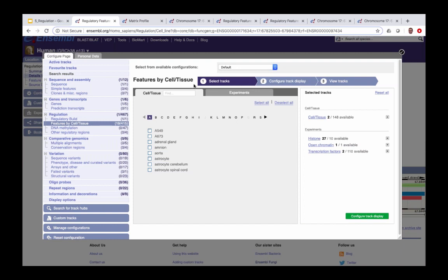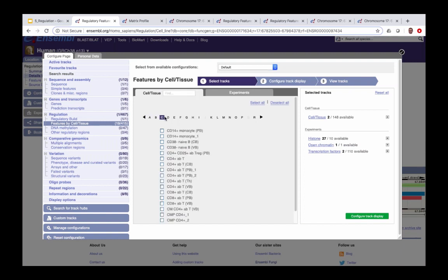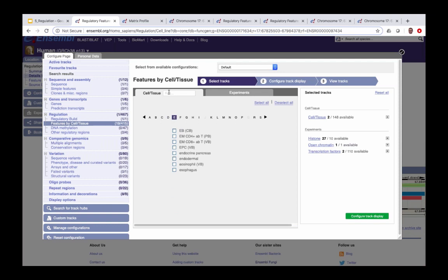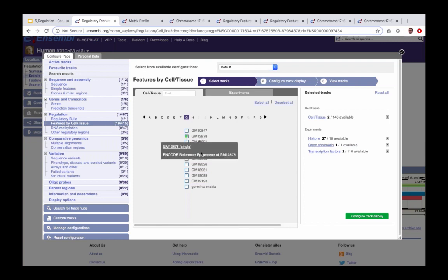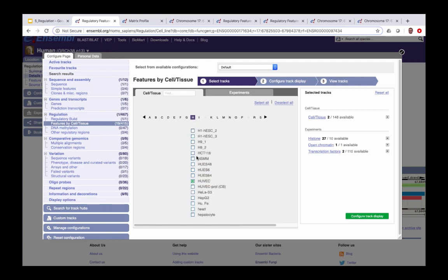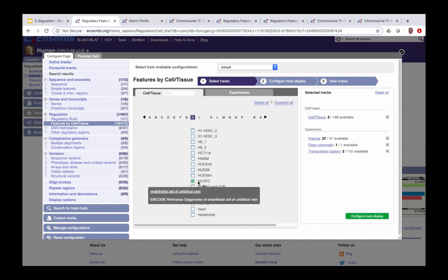In the configuration pop-up, we have two tabs. First, the cell/tissue tab where we can use the search function or browse alphabetically to find cell types. I'm going to add the GM12878 cells and the HuoVec cells by clicking on them.